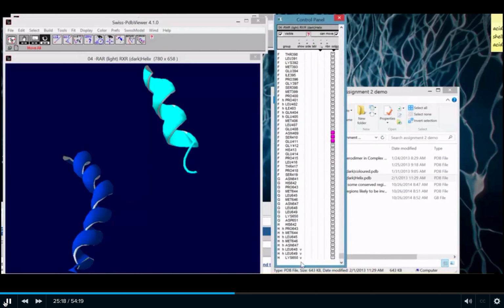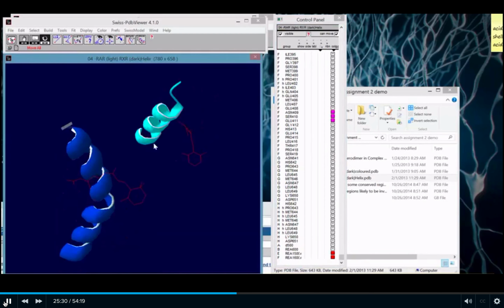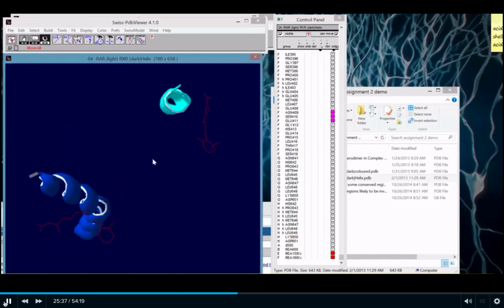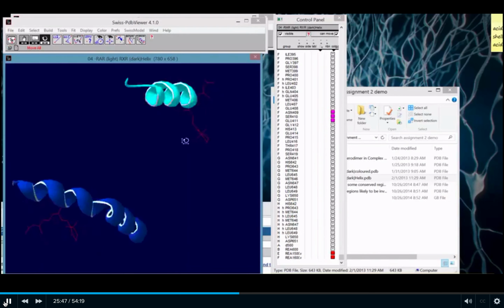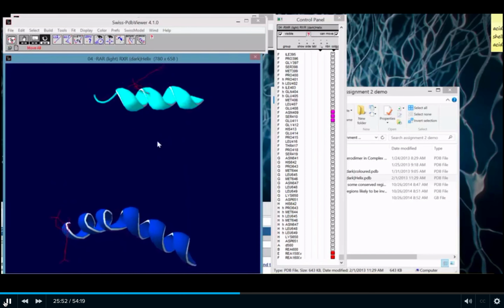So one of the things that seems to be describing, or at least accommodating this particular shape, is the orientation of these helices. This helix is in the way, so physically all-trans-retinoic acid does not fit in here, versus this helix, where 9-cis-RA fits as well as all-trans. So this explains why this protein is promiscuous and can bind to either, because it can physically allow it. Again, this is the tail. If it juts out, as I rotate, it should pierce into the plane of the monitor.